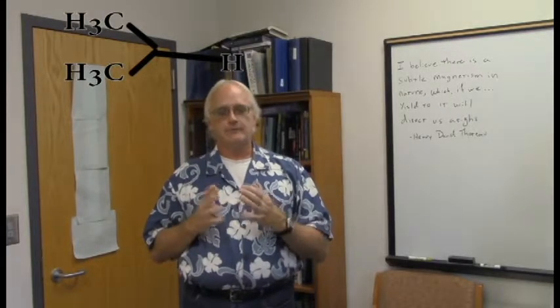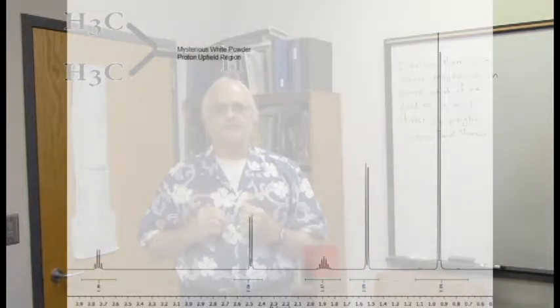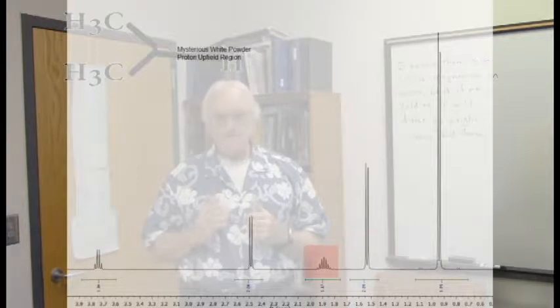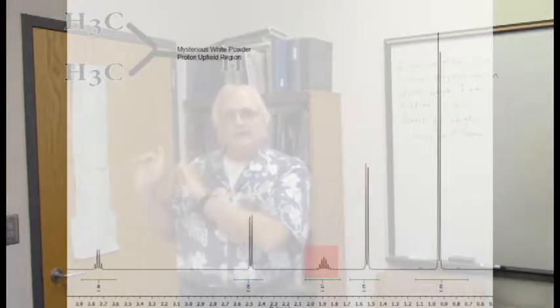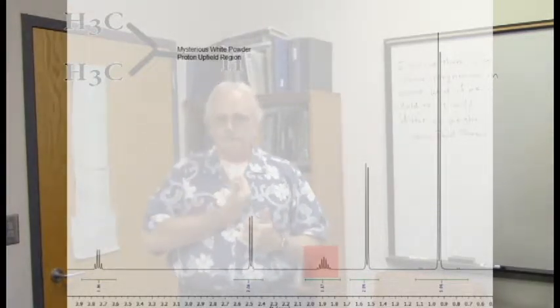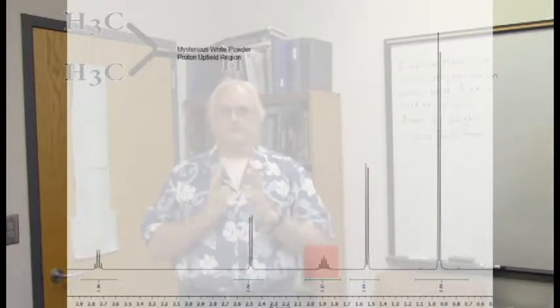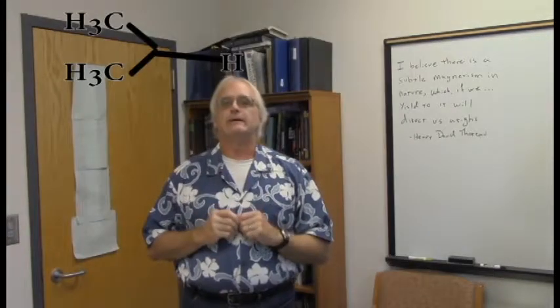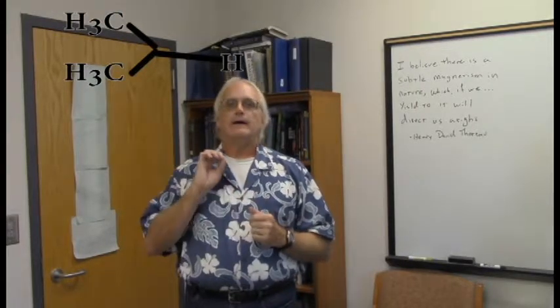We look at it on the proton spectrum, and sure enough, it looks something like a septet when we look at the full proton spectrum here. And it's not a huge surprise. Back over here, there are 6 equivalent protons. 6 equivalent protons would split this signal into a septet. Okay, so it's kind of consistent here that this is where we've ended up.